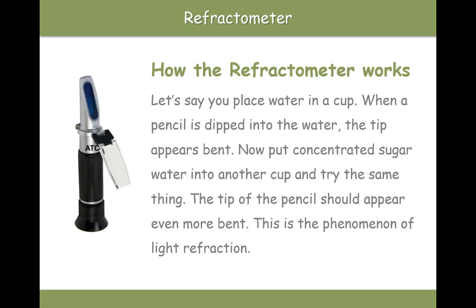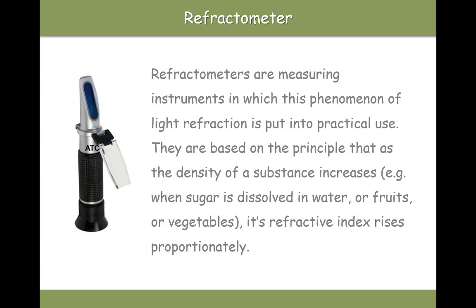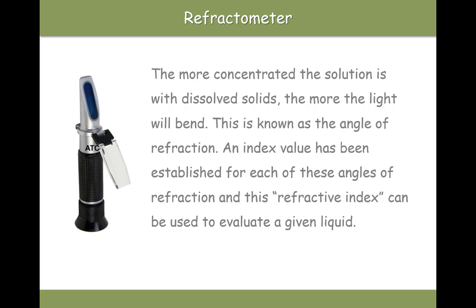Okay, so refractometers are measuring instruments in which this phenomenon of light refraction is put into practical use. They're based on the principle that as the density of the substance increases, e.g. when sugar is dissolved in water, or fruits or veggies or whatever, its refractive index rises proportionately. So the more concentrated the solution is with the dissolved solids, the more the light will bend. This is known as the angle of refraction. Okay, an index value has been established for each of these angles of refraction, and this refractive index can be used to evaluate a given liquid.